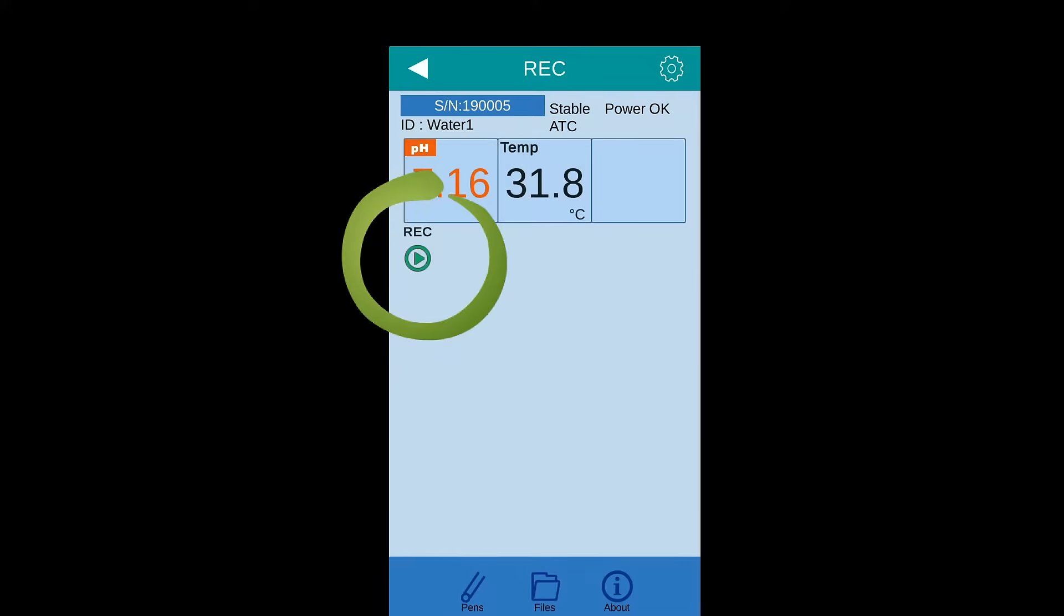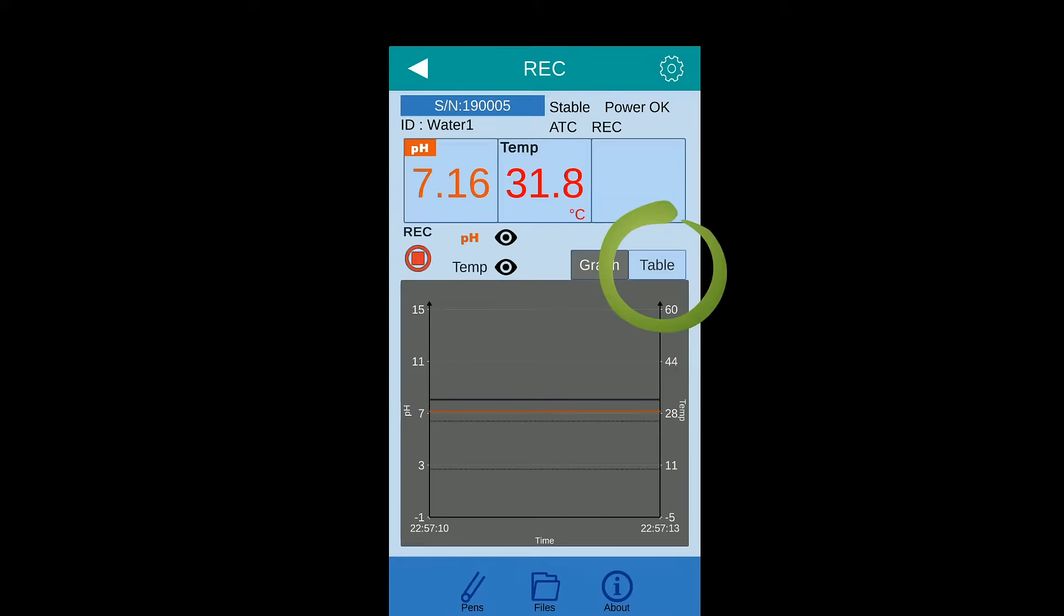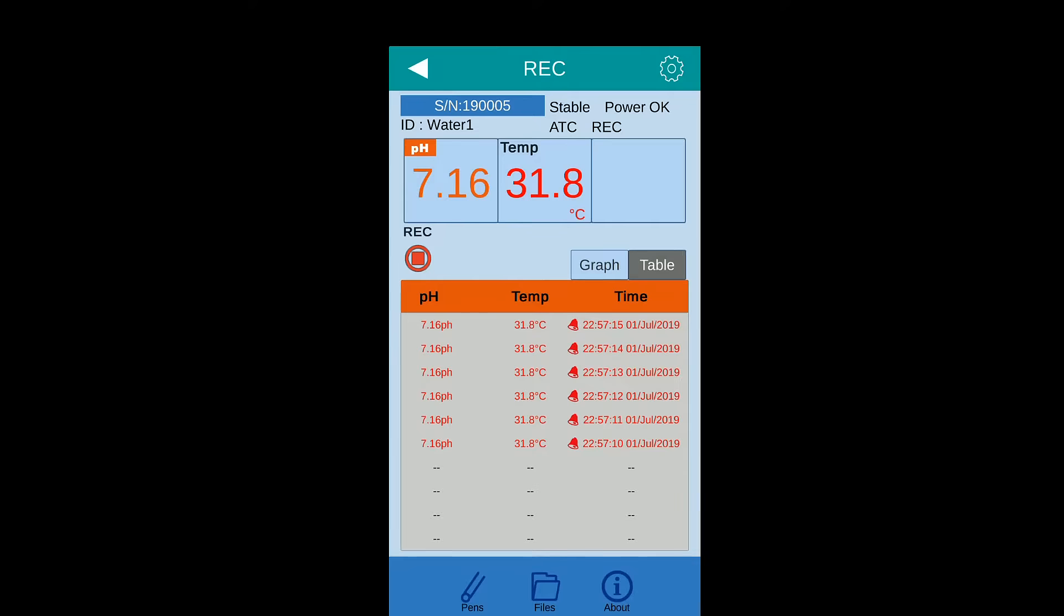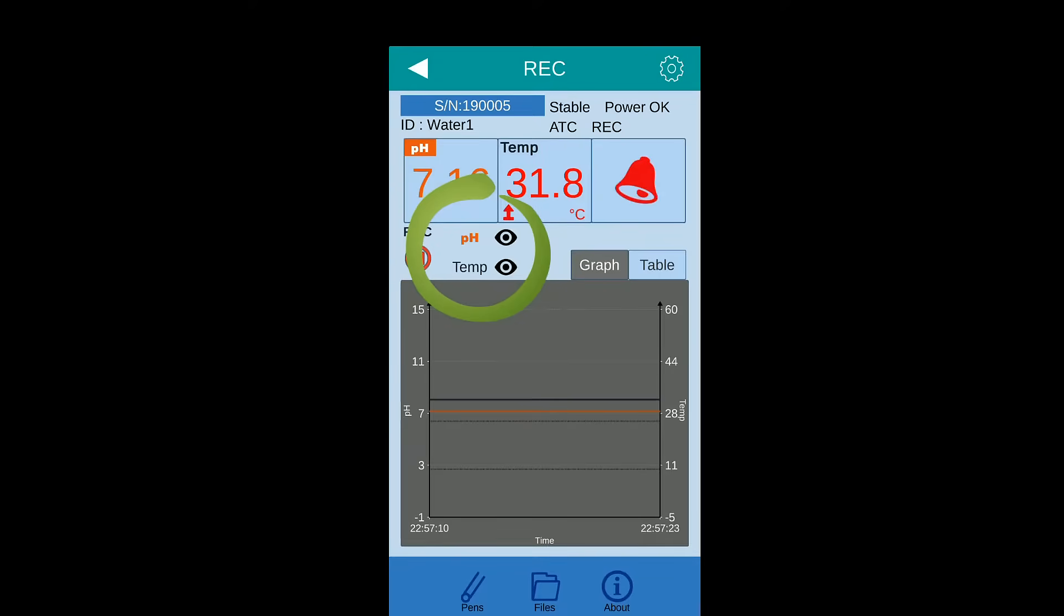Press record icon to record the measured data into app. Click table to see the real-time recorded data. Press I icon to display or hide the real-time curve.